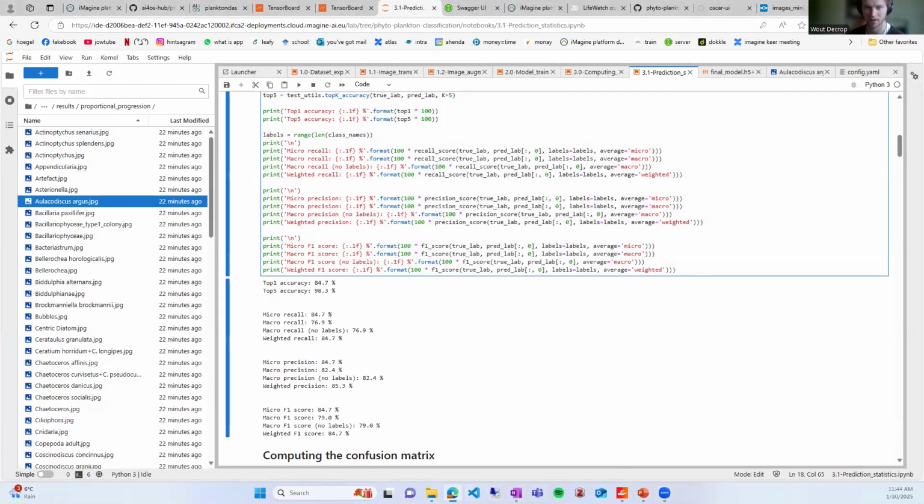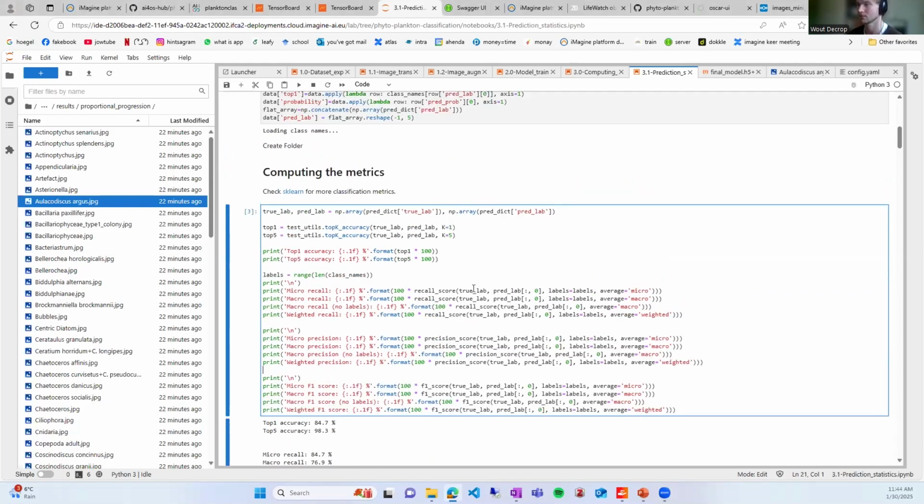I'm not sure if I fully understood the question. Quality control of the right image classification. So let's see if we can have further details. So maybe you answered it correctly. Yeah, Stella Berger, you can always reach out to me through email, or you can put your question more thoroughly in the chat if it's possible.